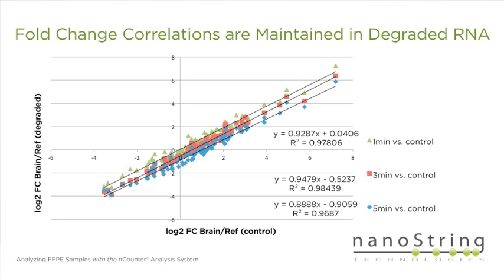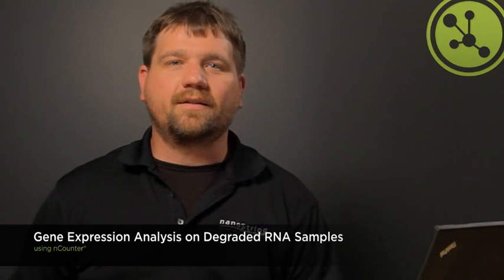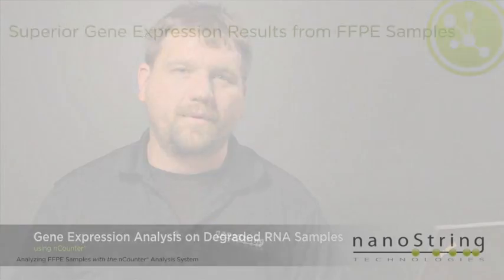Again, we observe excellent correlations across the code set between the degraded and the intact samples, even at the 5-minute degradation point, which is approximately 500 bases. The results further support the utility of the nCounter system for gene expression analysis on degraded samples such as FFPE.